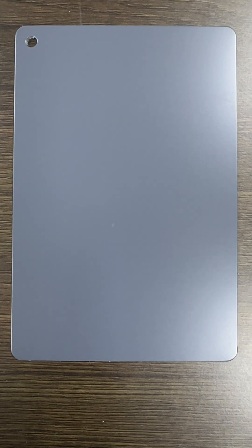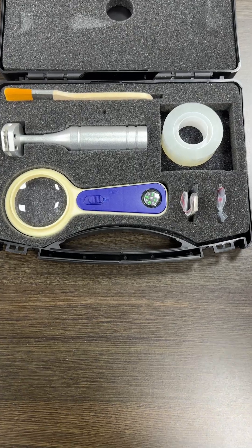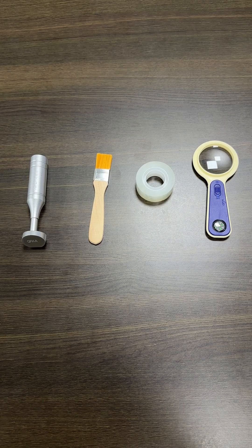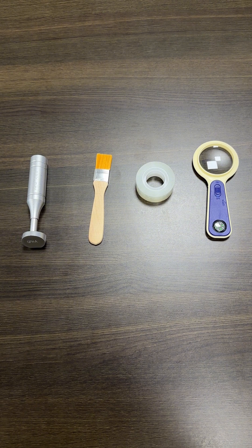The sheet's surface has already been cleaned up. We use cross-hatch kit tools including a handle, brush, magnifier, and blades.